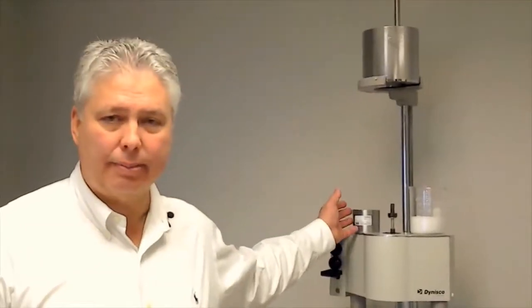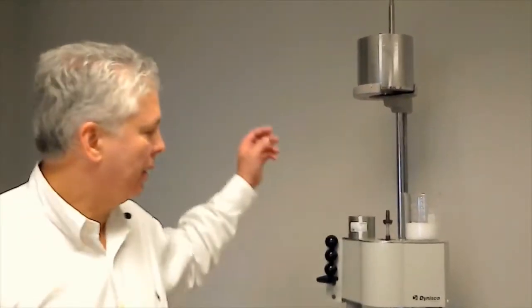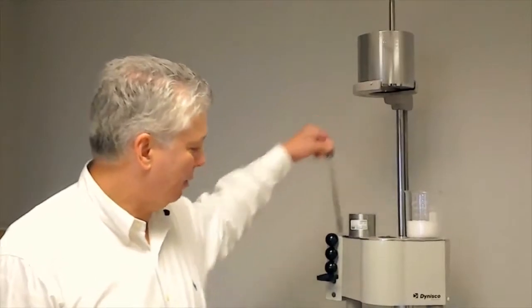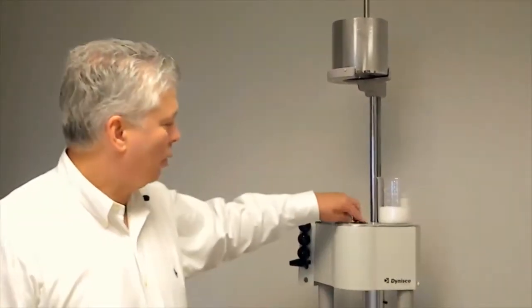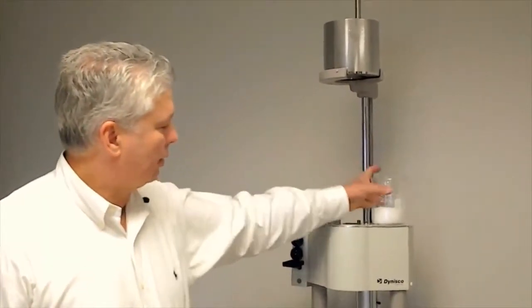This is the apparatus here. It's very simple. It consists of a chamber which is going to be really hot.